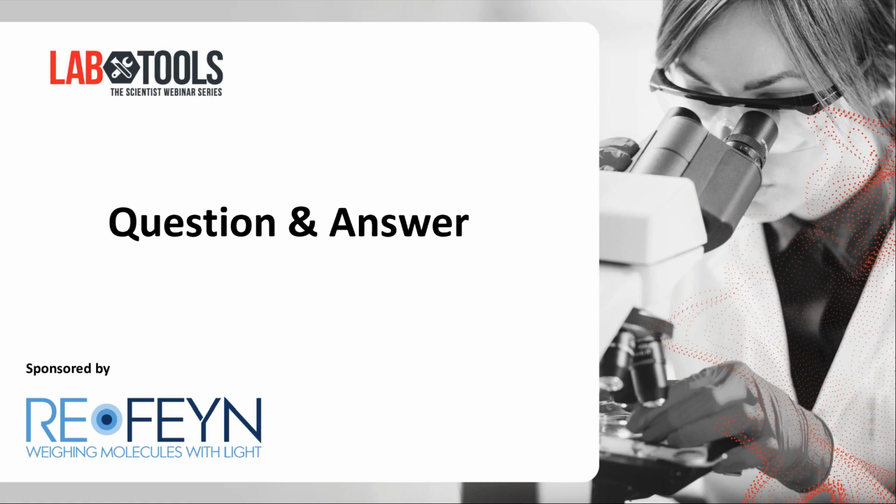Great, thank you. And I actually had one more come in. How do you get sub-diffraction limit resolution to resolve protein particles in the X, Y, and Z?